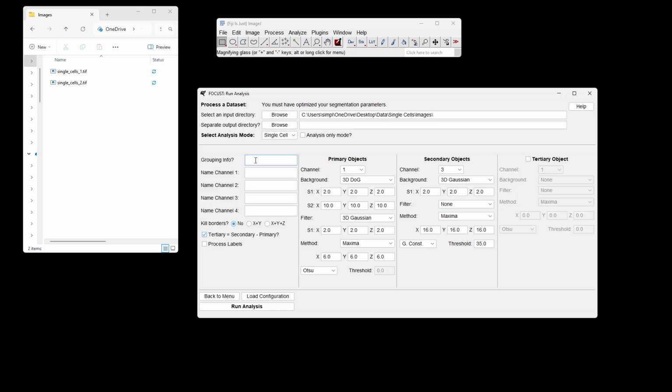enter a variable here. For example, maybe all of the images in my experiment folder here are from my control group, or maybe they're from a drug dose that you'd like to record, or maybe they're from a particular condition. If you'd like everything to be affiliated with a group for your subsequent analysis, you can enter that here. For this purpose, I might write test.